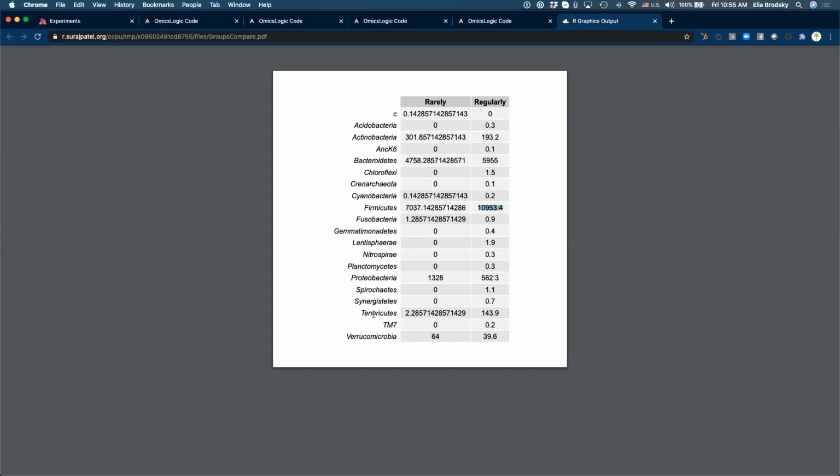And here you can see, for example, tenericutes, it's 2 versus 143. So what are these tenericutes?